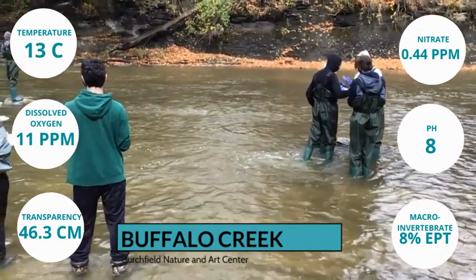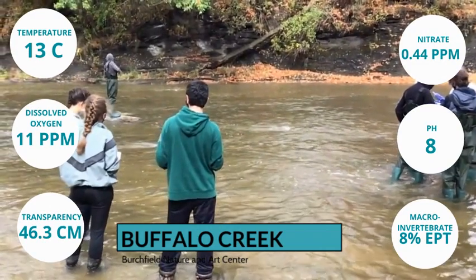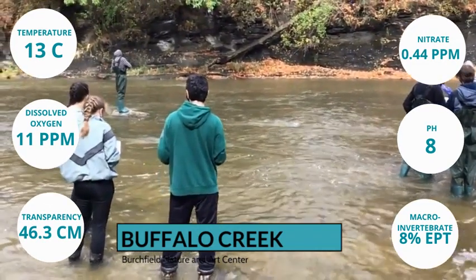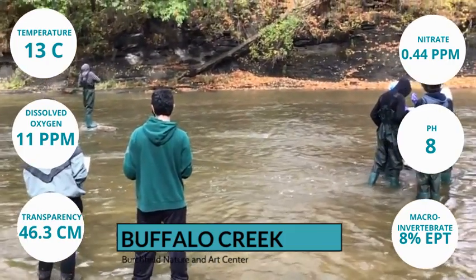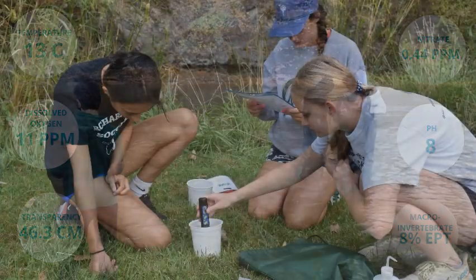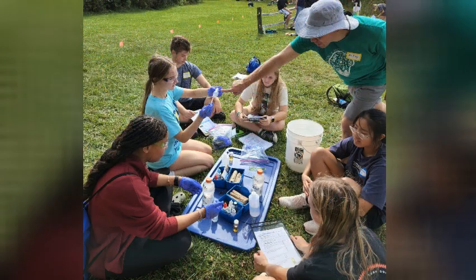Students measure water clarity, temperature, pH, conductivity, dissolved oxygen, and levels of nutrients like nitrate and phosphate. Some students may even map their site or measure the flow and discharge rate of the water. Students may rotate through all of the stations, or teachers may create expert student groups to perform each test.